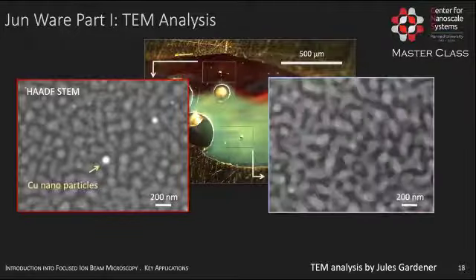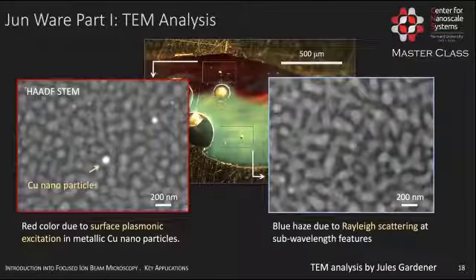If we now go to the blue region, you see again two immiscible silicate phases, but this time the morphology is much more complicated and you're forming an intricate network. So Jules has used all her tricks to analyze the chemistry and the crystallography of the system, and we can really learn something about the optical properties of this material.